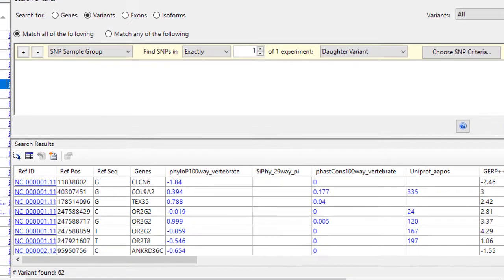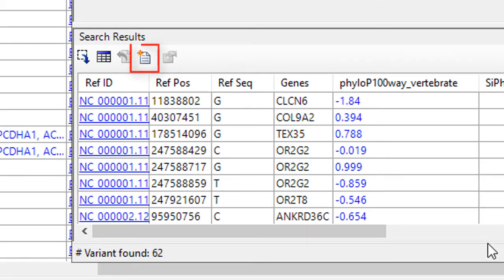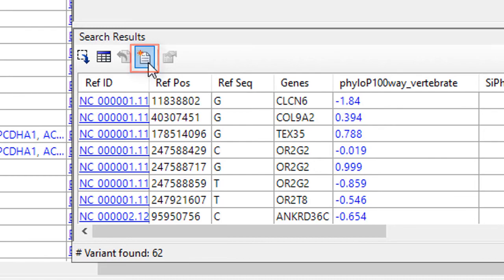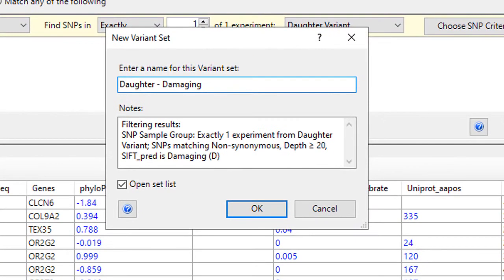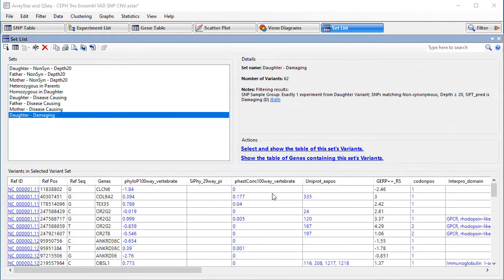You can quickly see we've narrowed this down to 62 variants. You can adjust these filters however you like. And once you're satisfied with the variant sets you've created, use this button to remember the results as a variant set.